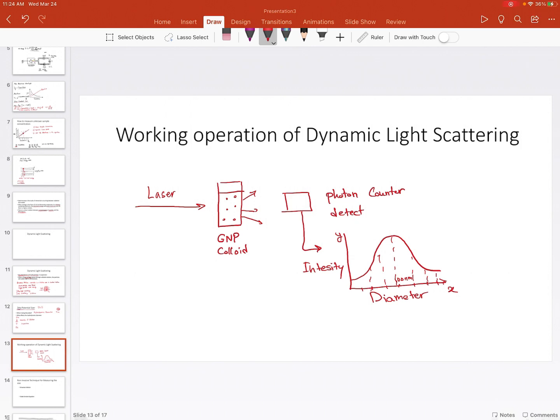In this technique, a laser is shot through a polarizer and into a sample. All molecules that are hit with the light will diffract light in all directions, and this process is repeated at short time intervals. For example, at time 0 the first laser is shined, at time 1 second it is repeated, at time 2 seconds this process is repeated.